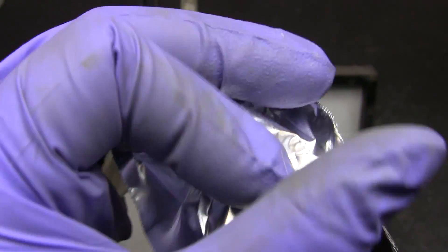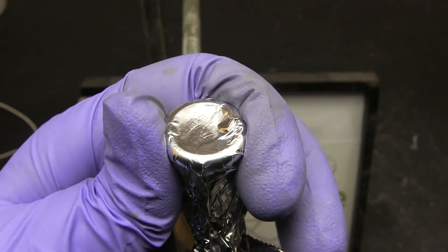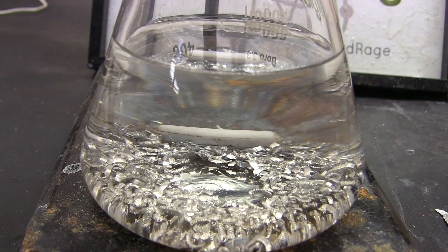On top of the condenser I'm going to put some aluminum foil to limit how much air flows back into the flask. For extra sensitive work you would use an oil bubbler setup or a drying tube. Now all we do is wait.